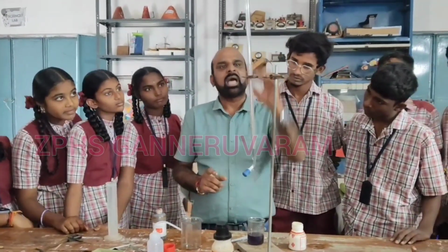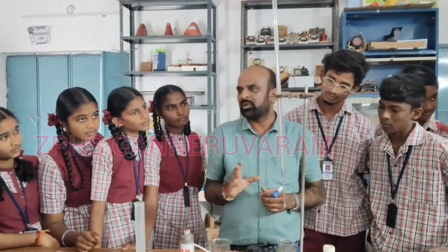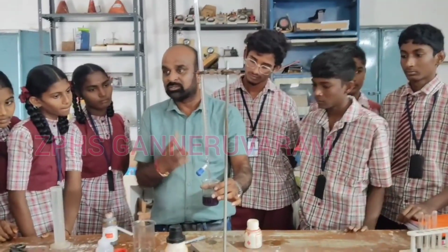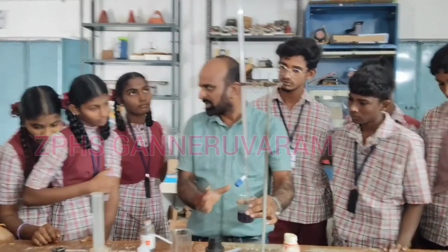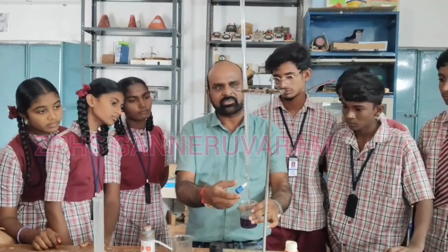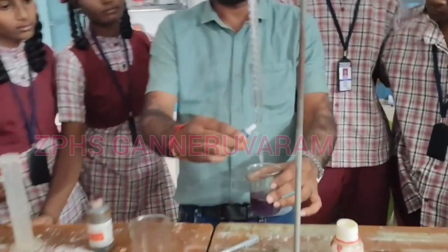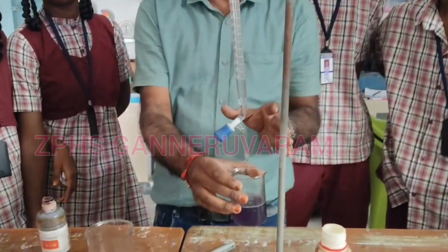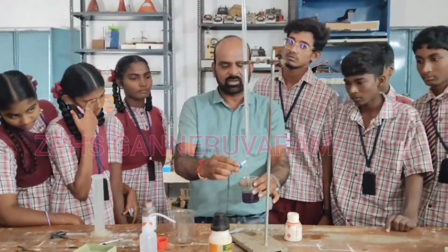So now I am doing the titration experiment, adding hydrochloric acid to this solution. What color will it change to, and how does the neutralization reaction take place? We can observe now. I am opening the stopcock of the burette. The hydrochloric acid mixes with the sodium hydroxide, and whether it changes to red color or not, you will see.